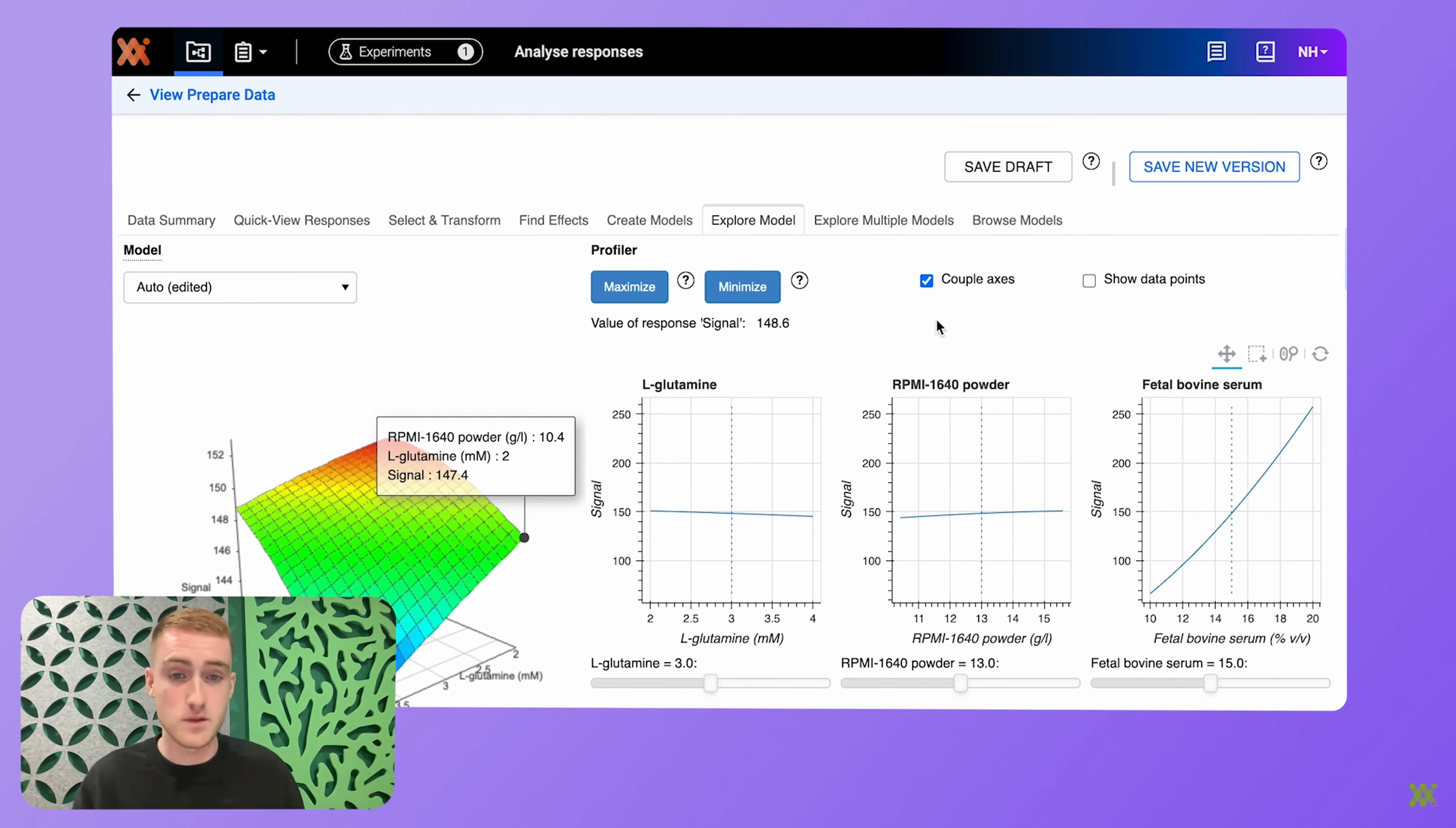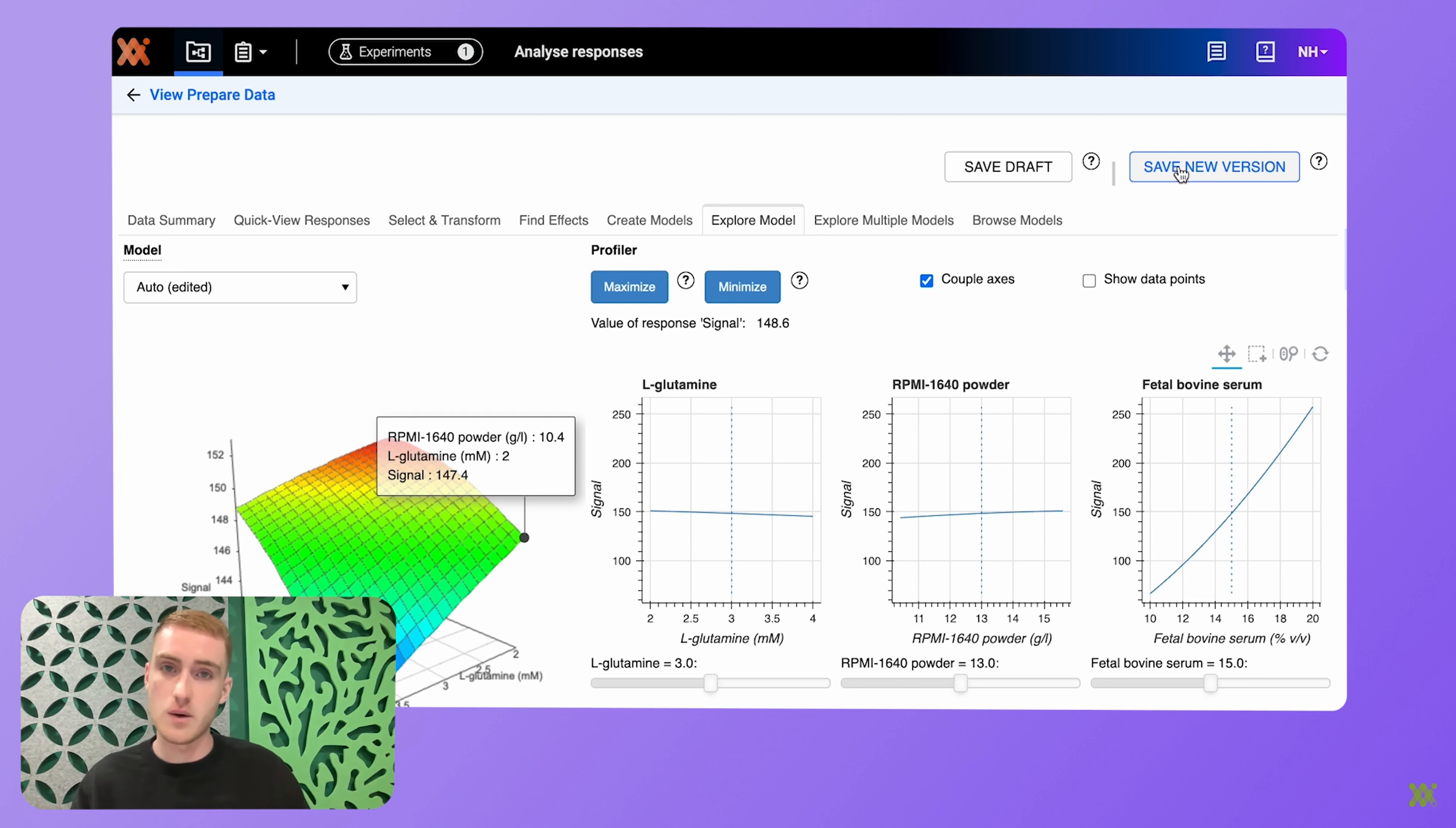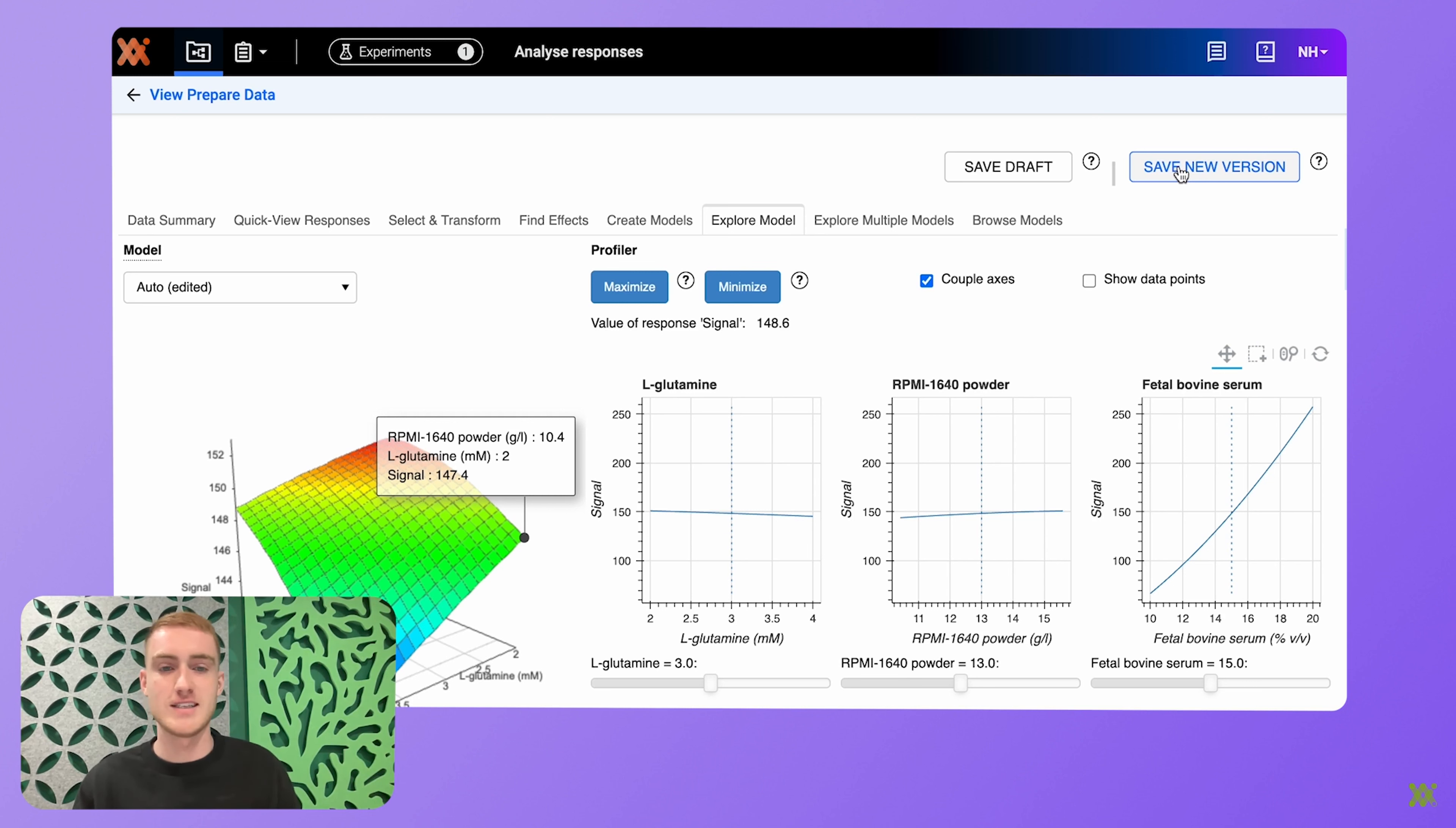And when you're happy with your models, you can save the analysis to a read-only state, copy that link, and share it with your colleagues. They can then have a look and marvel at your beautiful findings.